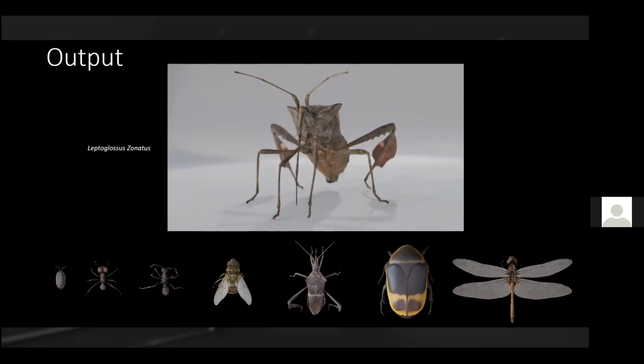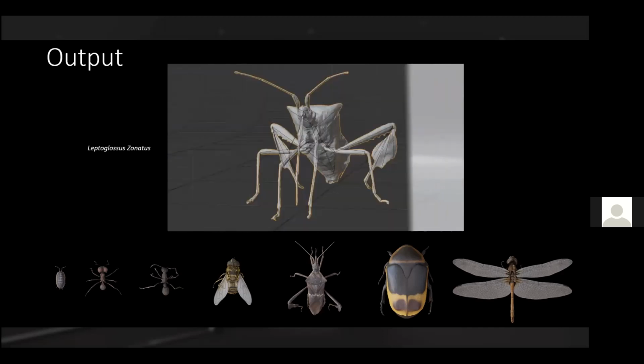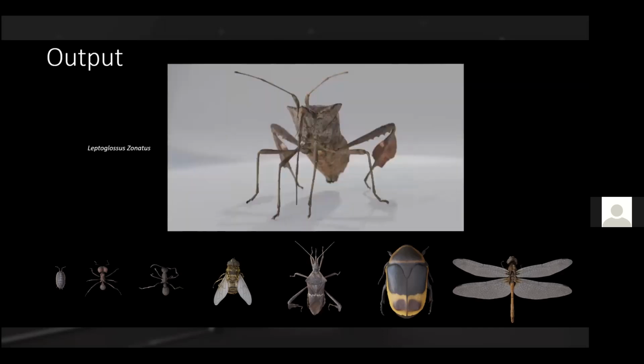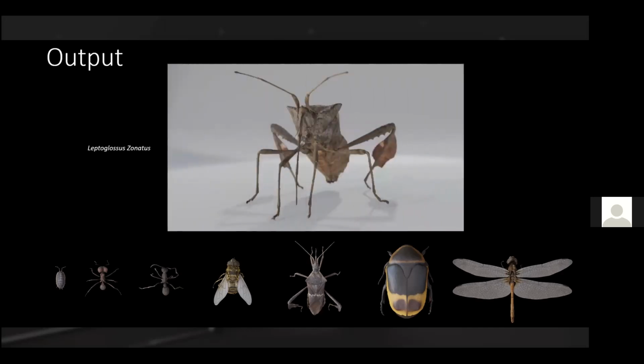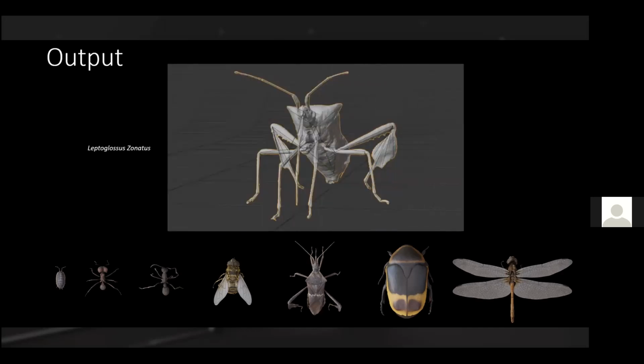In the bottom, you see a couple of examples. These are images of the 3D models, and at the top, you see a slider that goes between an actual fully rendered model, which looks relatively nice because you can have realistic shade and lighting, etc., and the neat raw model, if you will, without texture and color information superimposed, here of a bug that we work with.